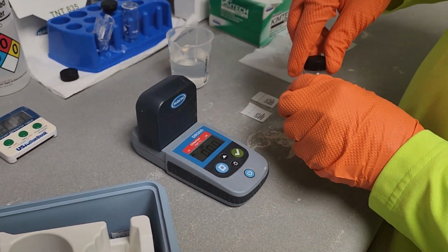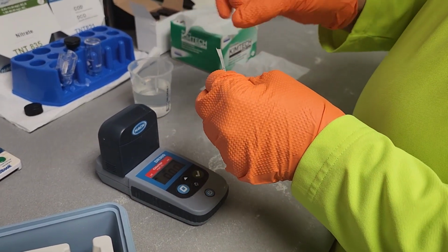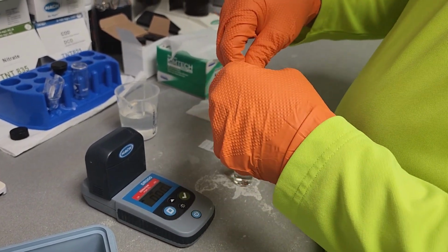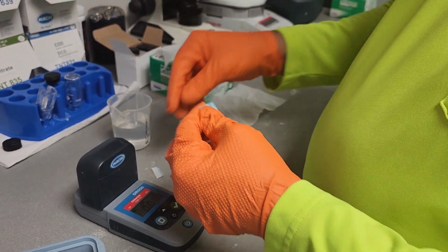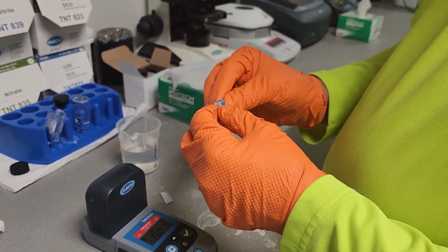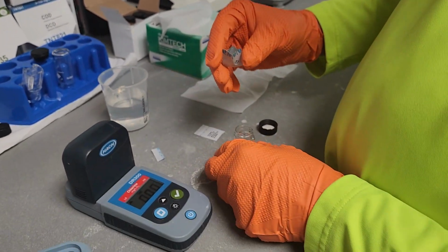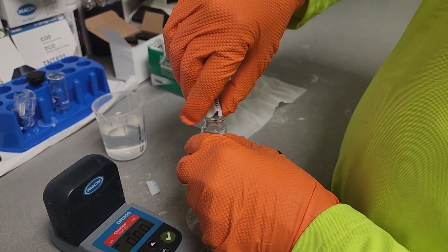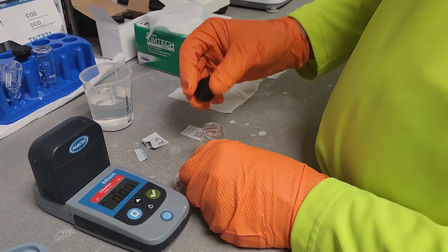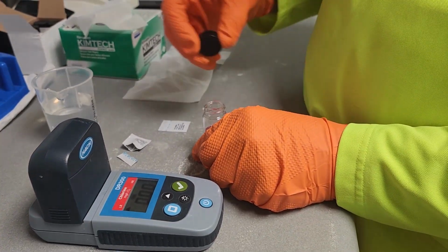Now I'm going to start with free chlorine residual. Here's the DPD packet. Give it a few flicks there. Tear it off. And I like to squeeze it just like this, give myself a little spout, a way to pour it in. Well, you see a reaction right away. You see that there is a chlorine residual, a free chlorine residual.